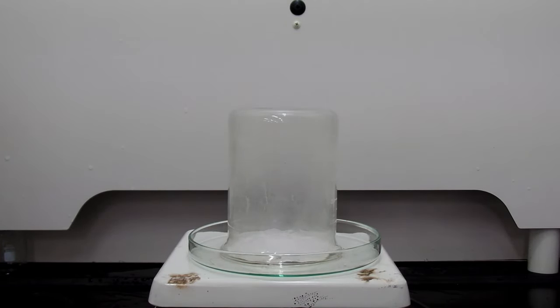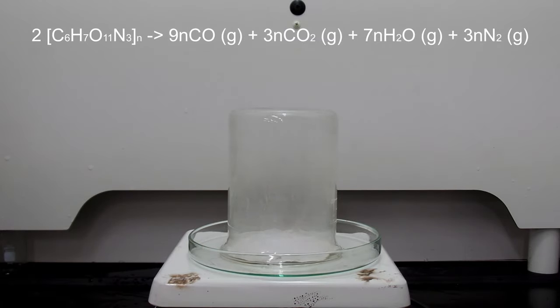When you look up the reaction formula of nitrocellulose on Google, it would say like this. But in this footage where I used a glass beaker to trap some of the gas produced, the color of the gas is reddish brown, indicating that we are actually making some nitrogen dioxide.